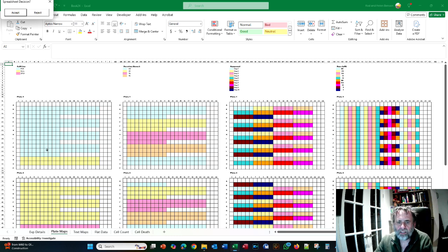But the problem here is you probably wouldn't want changing a cell line from PC9 to HeLa on the same plate. That'd be a real hassle. So what we need to do is finally just have a space in here. And of course we can do this very easily. We don't need to use a spacing character. We can do that with subplating on page 5. So let's just do that.